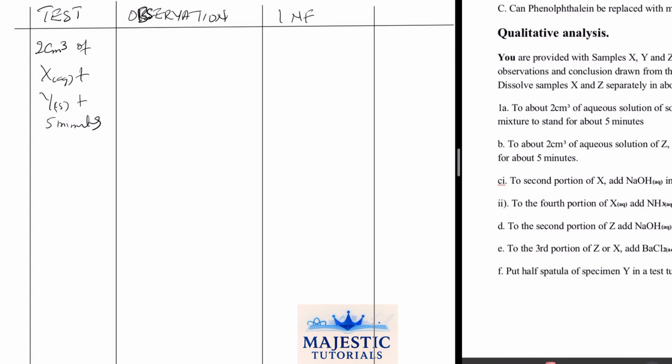This is a displacement reaction. Remember, zinc will displace copper from copper(II) sulfate, so there will be brownish particles.